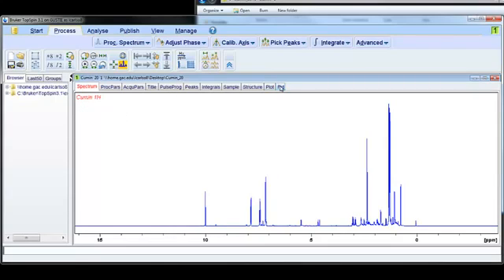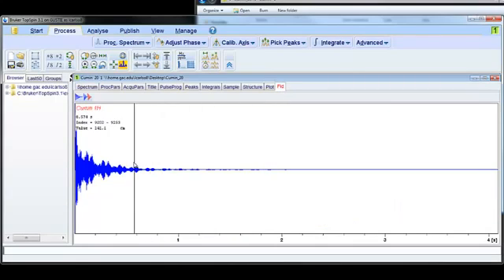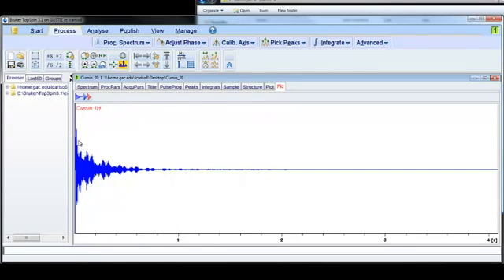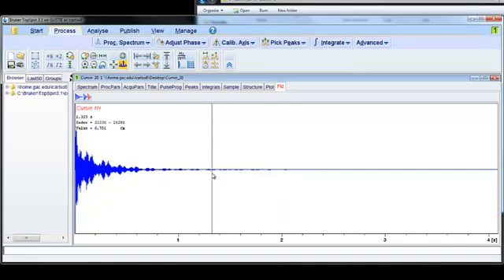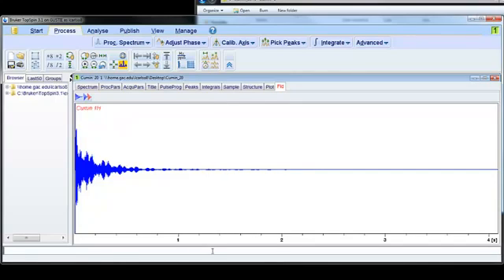So if I go back to the FID, you'll see that the typical shape of an FID is kind of this tapered arc. A lot of these points out here, these small little data points, are actually noise. They're not true signals from your sample. So in order to improve the signal-to-noise ratio, we can perform what's called exponential multiplication, which is a mathematical function that will truncate the data and improve your signal-to-noise ratio.